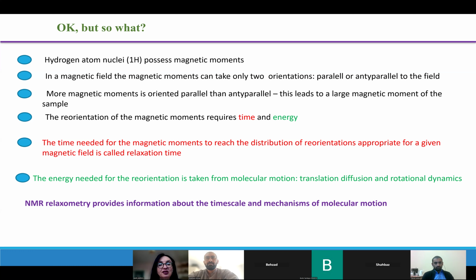But one can also say, if one sticks to the concept of diffusion, that this is diffusion in a gradient. So it is like a mixture of two kinds of molecules, and they are separated. At the beginning, in one place, there is more of one kind of the molecules, less of the other. We can also have two boxes, in one part one thing, in another part another.